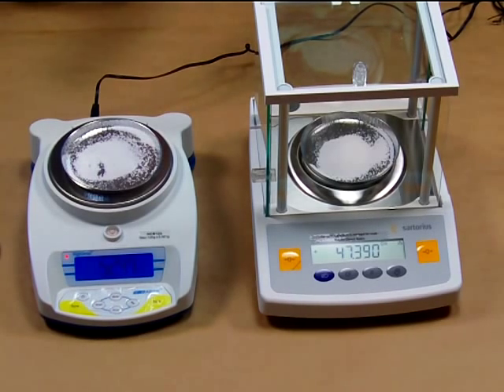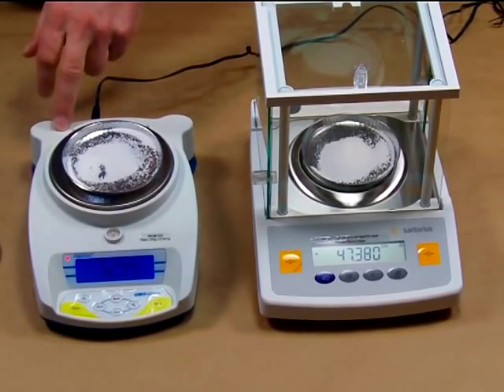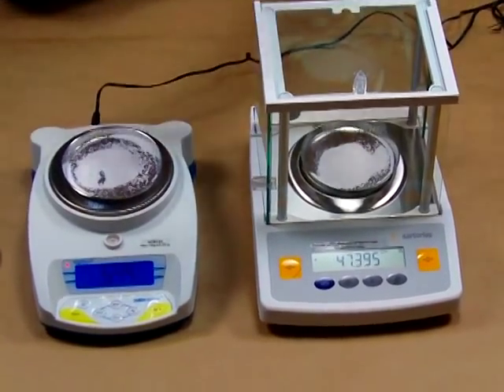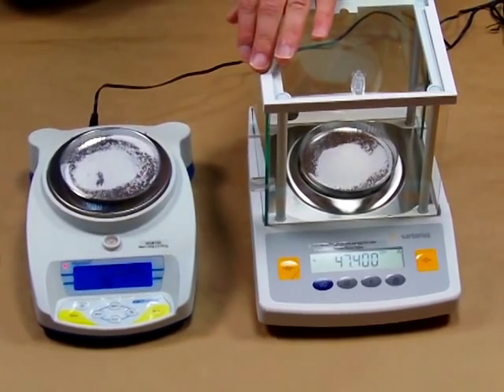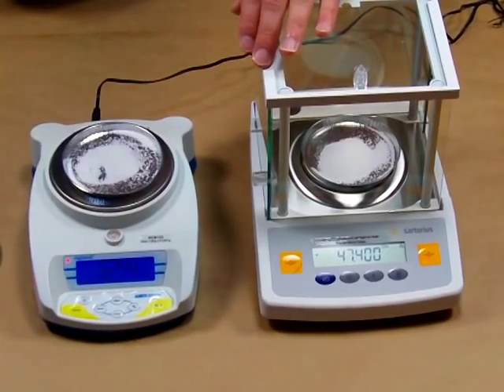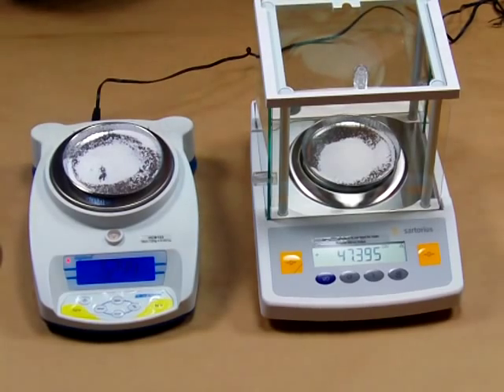If all you have is $300, the HCB123 is what you can buy. But if you're a perfectionist and want perfection, you really need to go with a force restoration balance. We would recommend the GD503 from Sartorius or the A&D FX series — we have the FX120, the FX200, and the FX300. All available at balances.com.